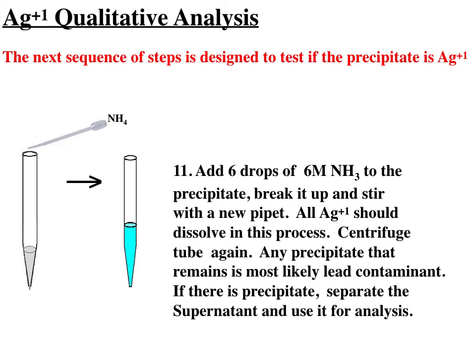So I'm going to take my precipitate that was left over from complexation of the lead and removing the lead. I decanted off the solution containing the lead.